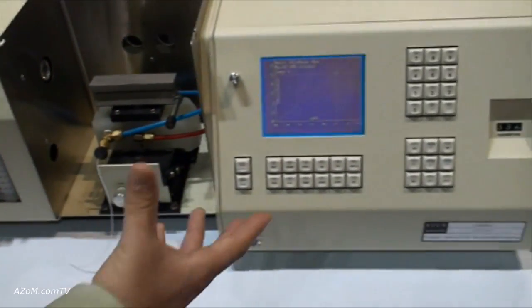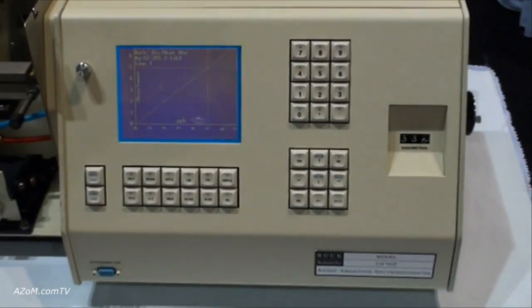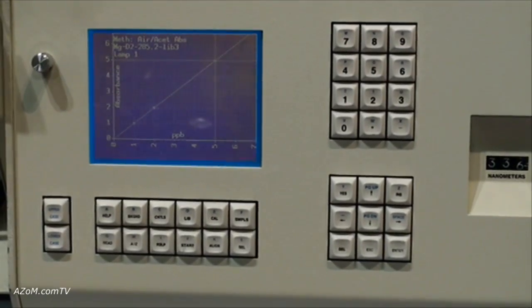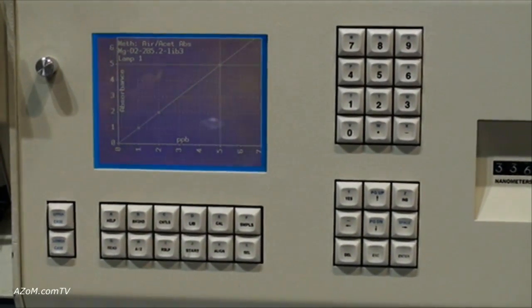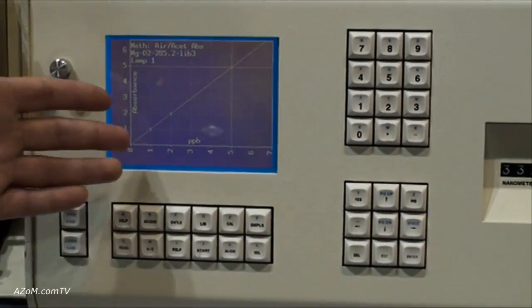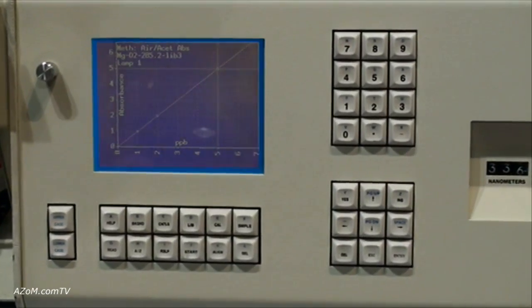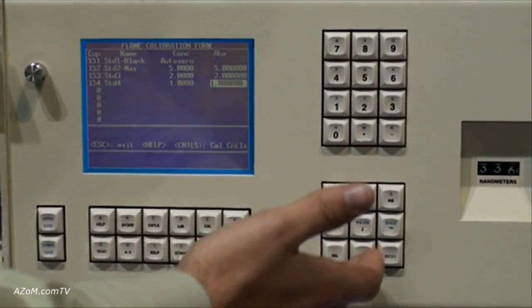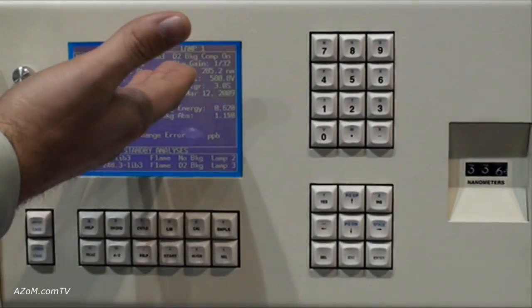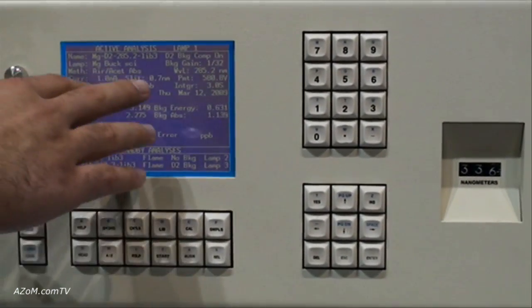Over here we have our firmware screen — we can bring up the library for each metal. Atomic absorption is used mainly for trace metal analysis in the part per million range. Libraries can also be loaded, and the library tells you what wavelength to set the monochromator to and what slit width to use.